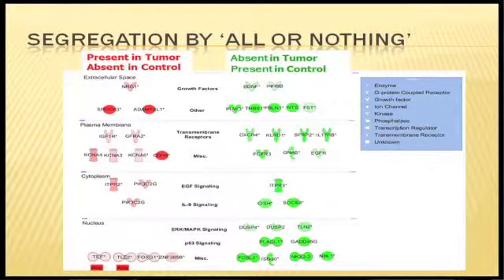If I'm going for a biomarker, this is the perfect biomarker, right? It's either there or it's not. And we've actually used this: in our tumors we found this growth factor, neuregulin-1, which isn't in the control tumors at all. And it's proven to be very important in the tumorigenesis of this particular tumor we're studying.